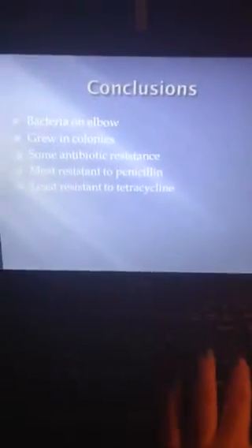And on this last set of plates, again, similar patterns, although the tetracycline tablet unfortunately fell off during incubation at some point. So the size of the little space right there is about the same as the penicillin and ampicillin. But again, we have no way of knowing how long the tablet was on there when that happened. Oh, sorry about that.